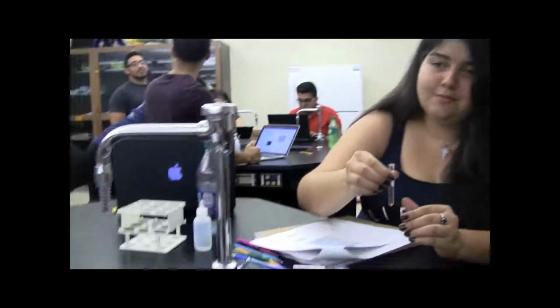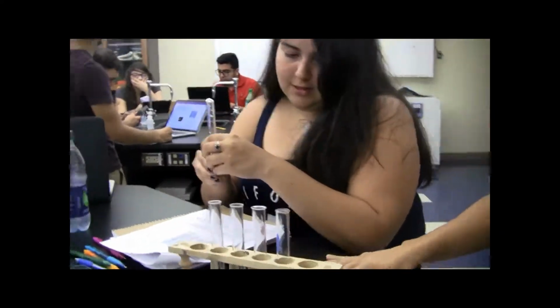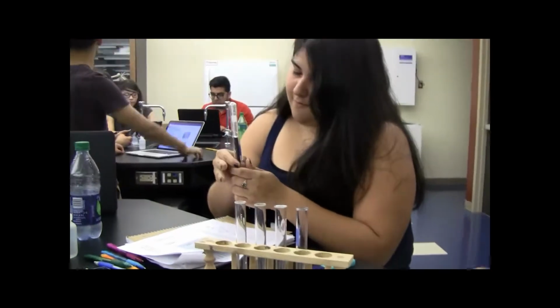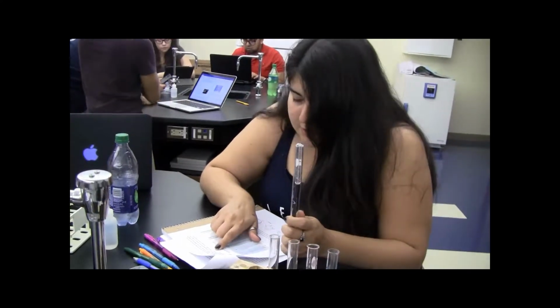I just completely filled the small tube with water. Okay, so this is step number 1. Put an empty large tube over the small tube. They're already labeled, right? Yeah. Holding the small tube up to the pencil, quickly invert the tube so the small tube is upside down.